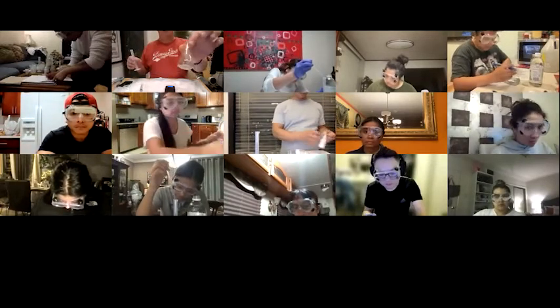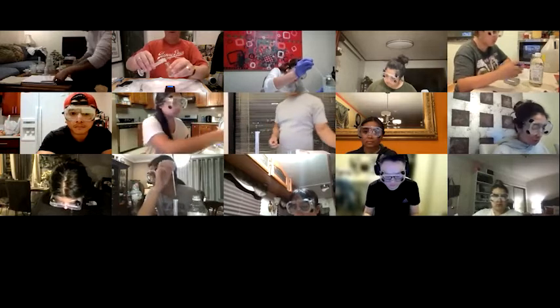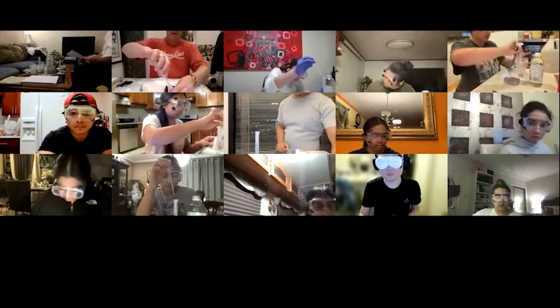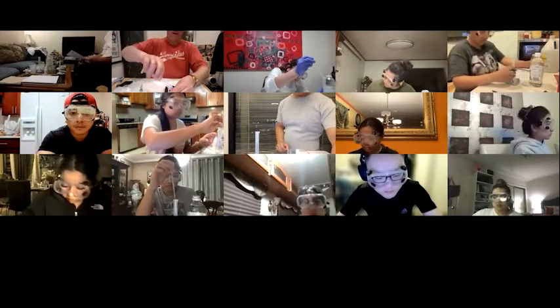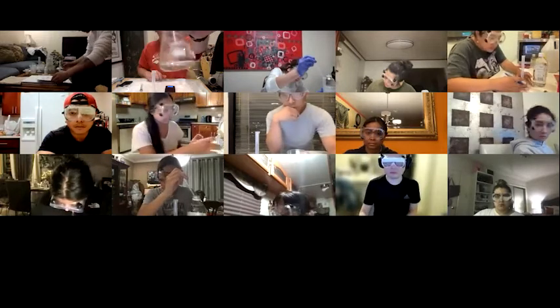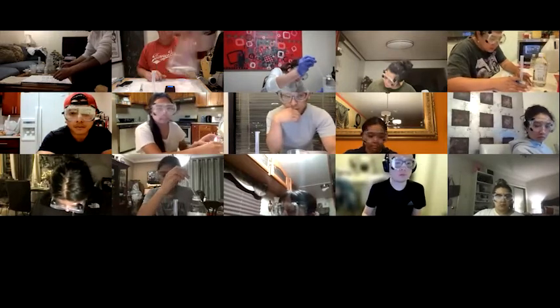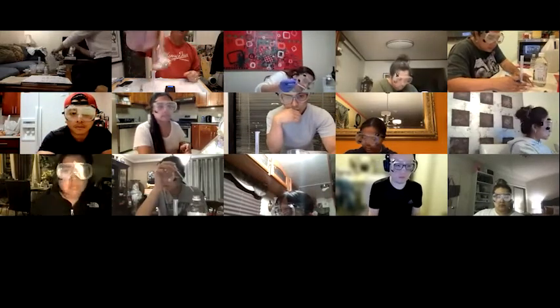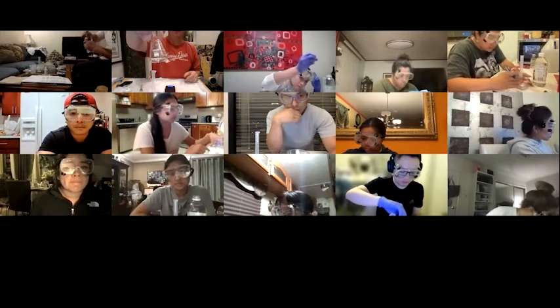So here is my cute little flask, and I'll transfer all of that in there. Now notice that I had some water in here already, but I am not concerned. Why is it not a problem if I dilute this now? I can add water to this and it will not affect the reaction.